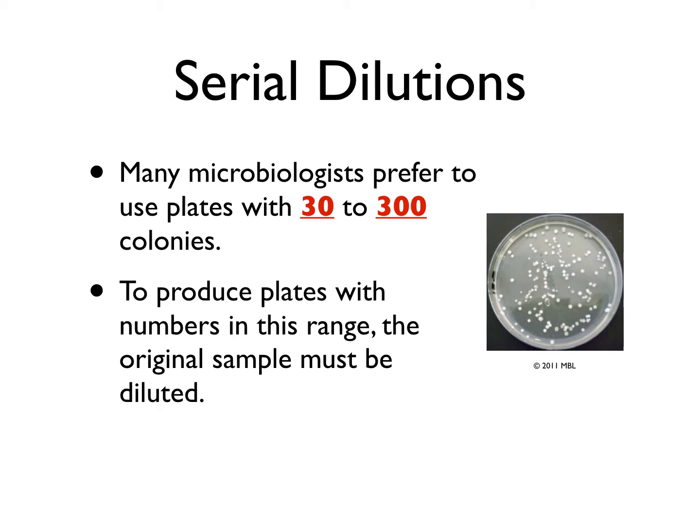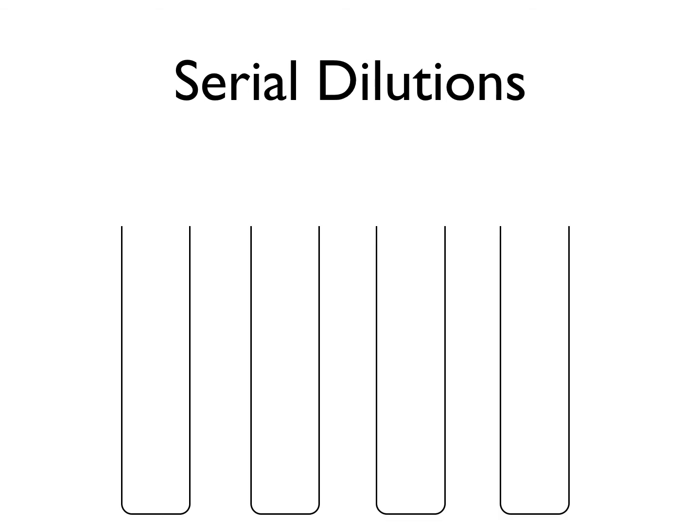Dilution simply means to make something less concentrated. Another way to think about it is that you're watering something down. To demonstrate, assume that you have 4 test tubes, each filled with the same amount of water. To the first test tube, you add 10 drops of blue food coloring, and you watch as the water in the tube turns dark blue.